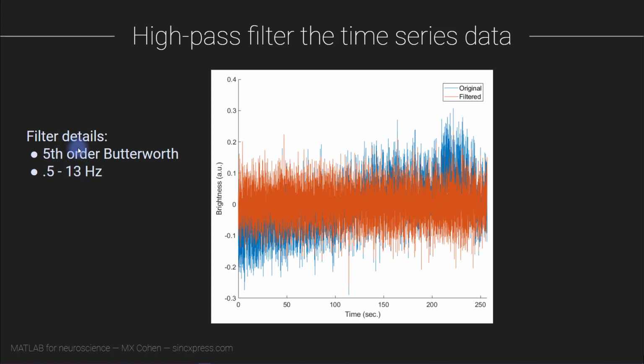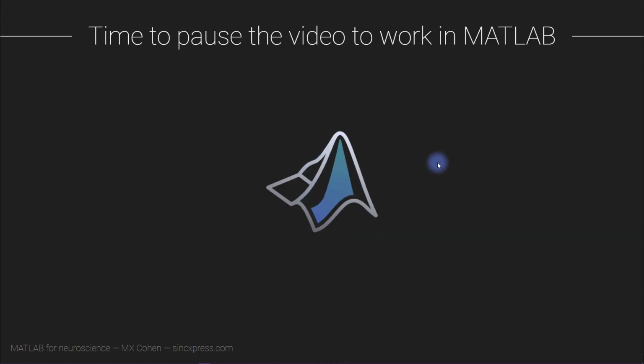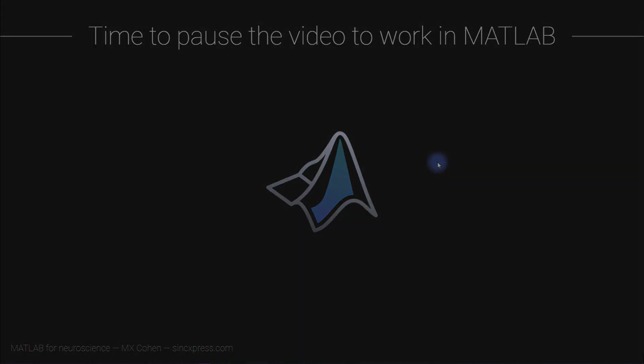In real analyses, you would want to make sure that this is an appropriate filter for these data, with appropriate filter characteristics and so on. But for now, you can rest easy knowing that this is a pretty good filter for these data. Now it is time for you to pause the video, work through the partially completed Matlab code, and now I'm going to switch to Matlab and walk you through my solution.